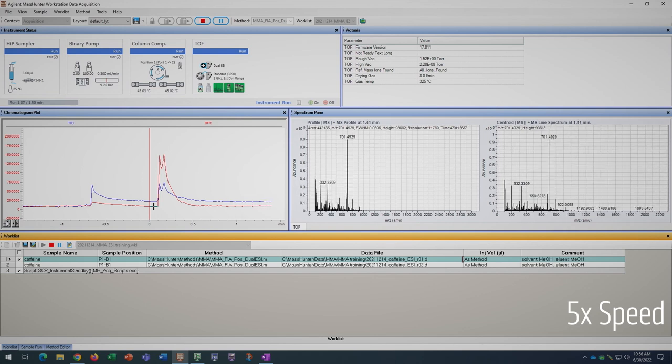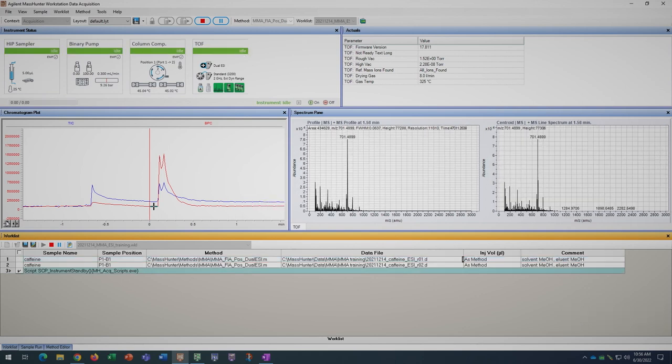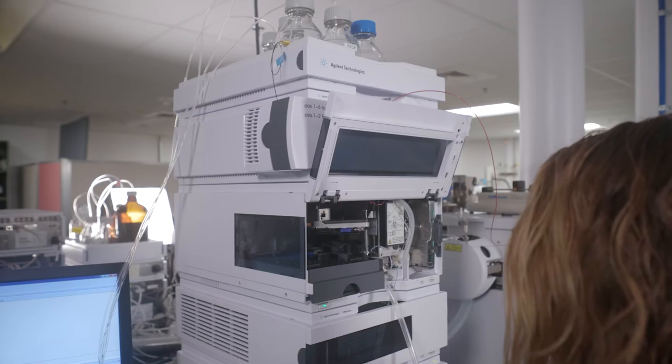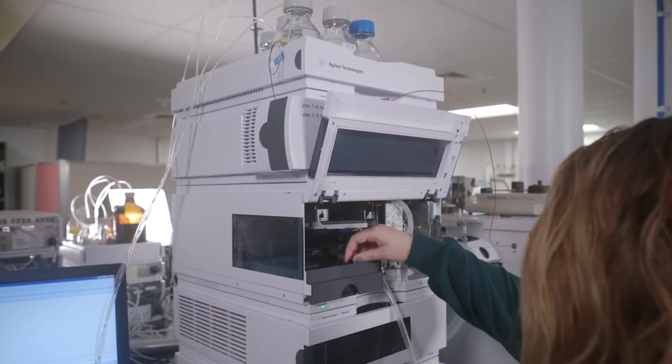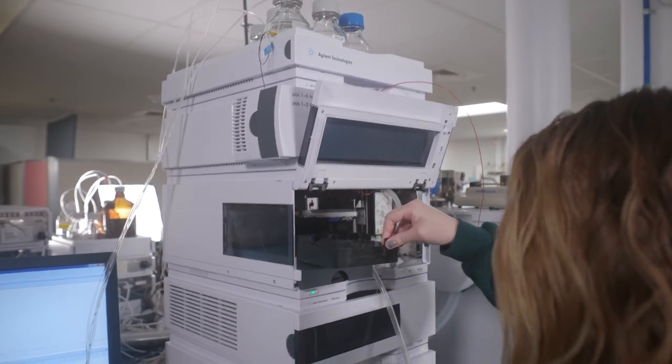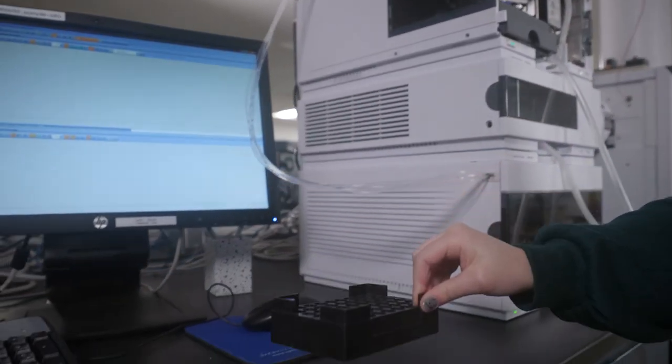Your data is automatically saved. If you want to rerun any samples, we suggest inserting a new row into your worklist and incrementing the run number for your sample file name. When you are done with the instrument, please make sure it is on standby before you leave the lab and remember to take your samples with you.